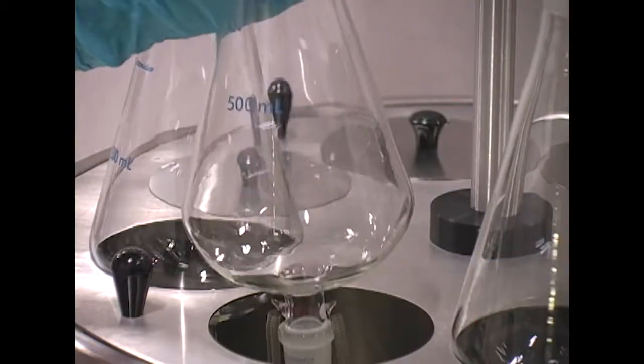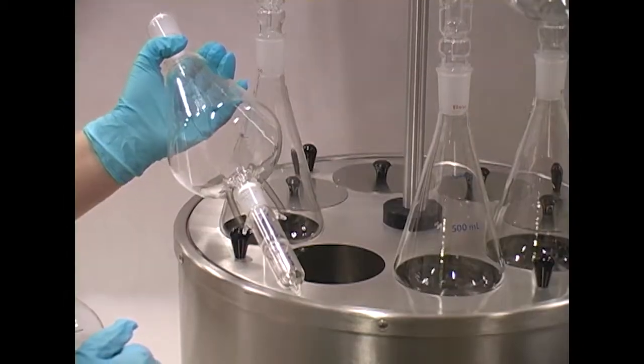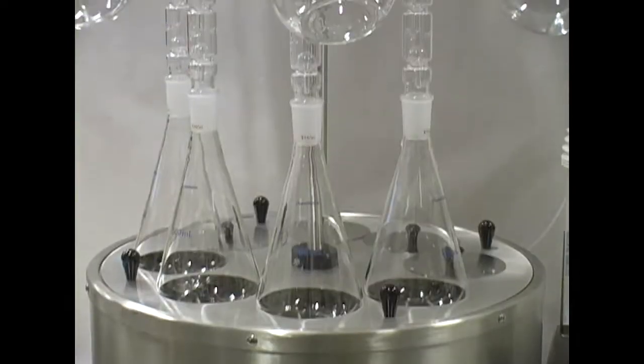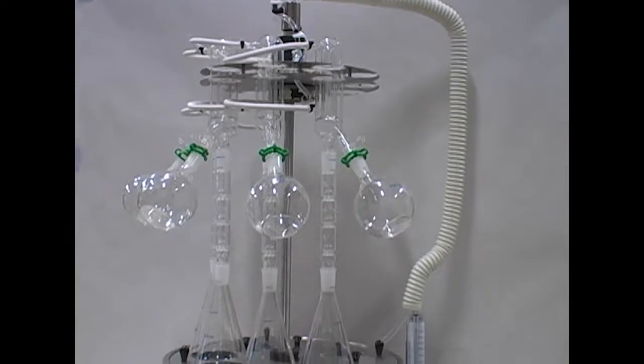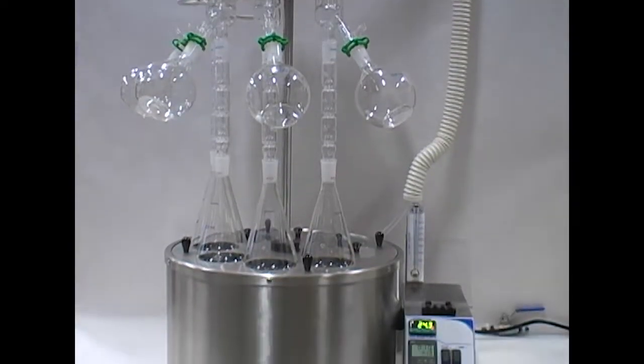Organimation's S-EVAPs decrease evaporation times, allowing for a more productive laboratory. We stand behind our quality, which is why when you purchase an S-EVAP, it comes with a one-year warranty and lifetime product support.